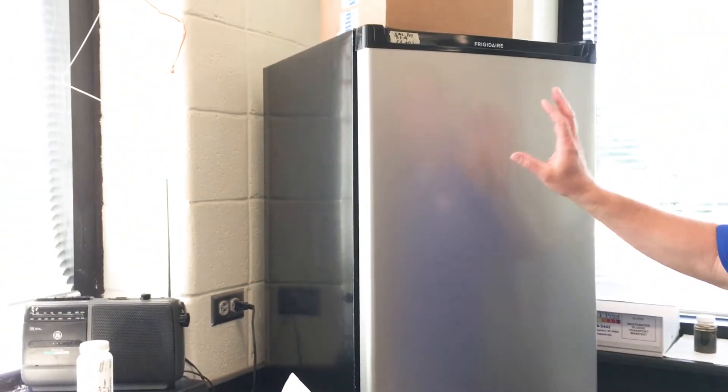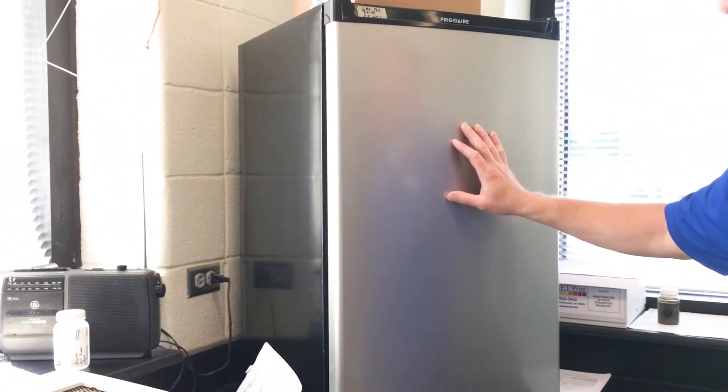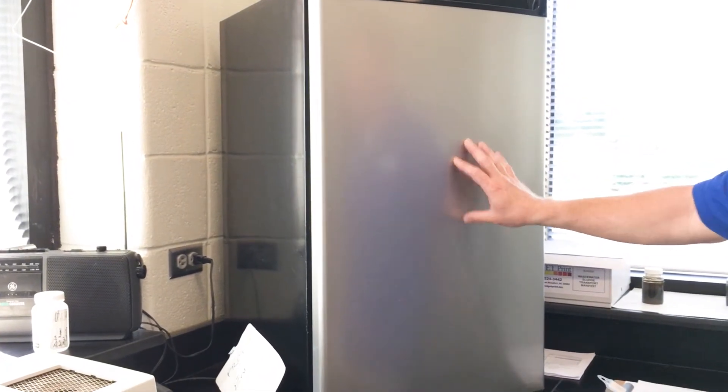The refrigerator is very important. This stores all our samples. You need them between one degree Celsius and five degrees Celsius to preserve them.